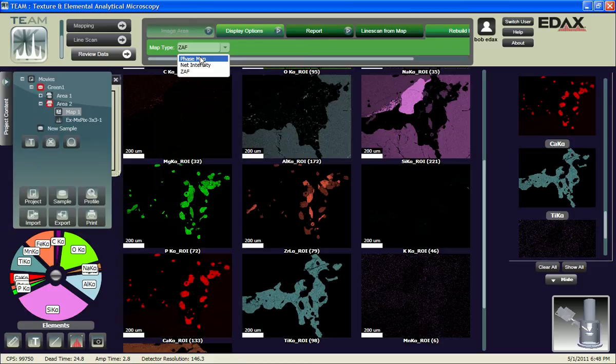In the rebuilding of the phase map, we start having all the spectral information. And then all we do is successive examinations of the data, or successive frames, you might think that it's frames, in reality it's successive re-examinations of the data, we actually are doing a refined examination and trying to see if we can get a little more sensitive. And quite often we can.